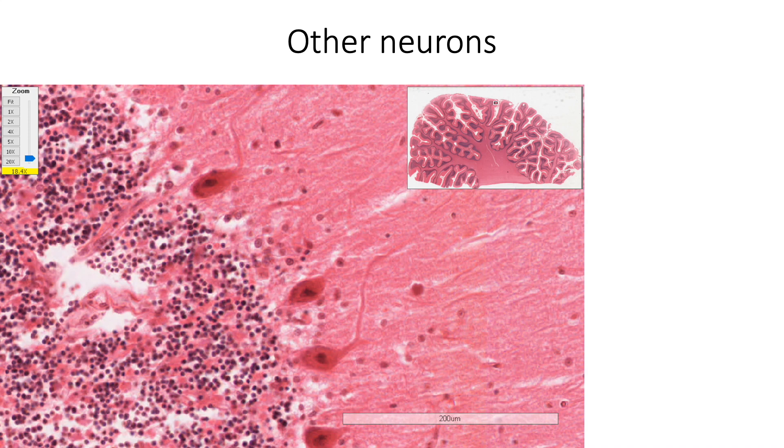In addition to the cells mentioned before, there are cigar-shaped inhibitory Lugaro cells in the Purkinje cell layer and unipolar brush cells, which are seen in the granular layer in the areas which receive input from vestibular nuclei.